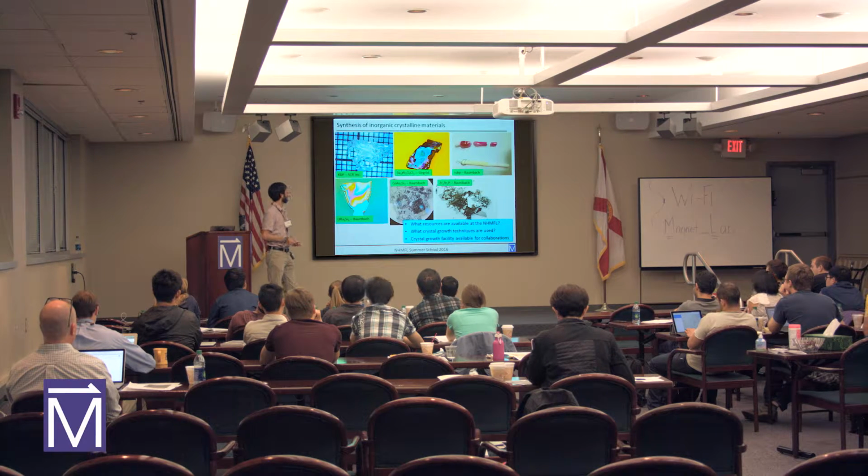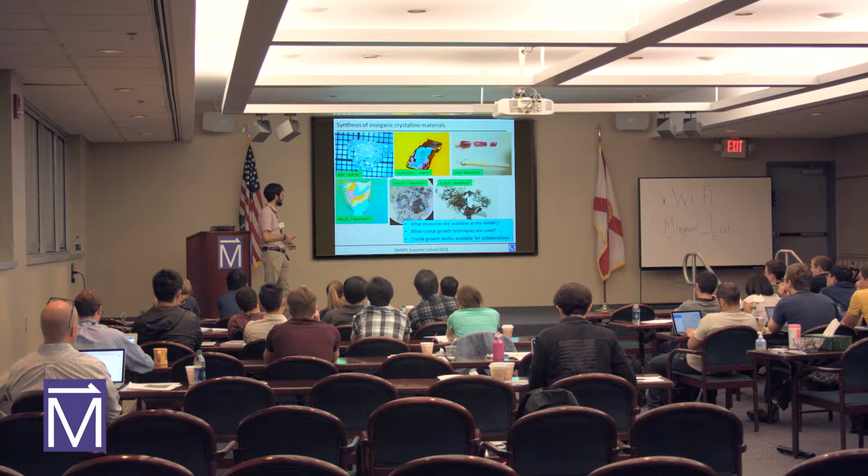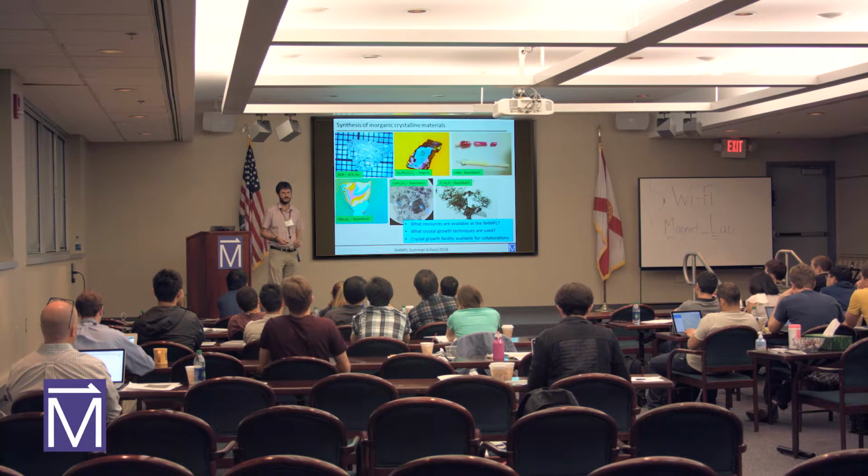It's no problem. Okay, so what we specialize in here is synthesis of inorganic crystalline materials. And what this means is that we span materials going all the way from some sorts of transparent insulators to, I think this is a semiconductor. This comes from Segrist Group. Okay, some ruby, that's kind of neat. Heavy fermion metals, like these guys, and topological or Dirac-Weyl materials. So I think that within the families of crystalline materials, you can ask for almost anything, and we can probably come up with it.